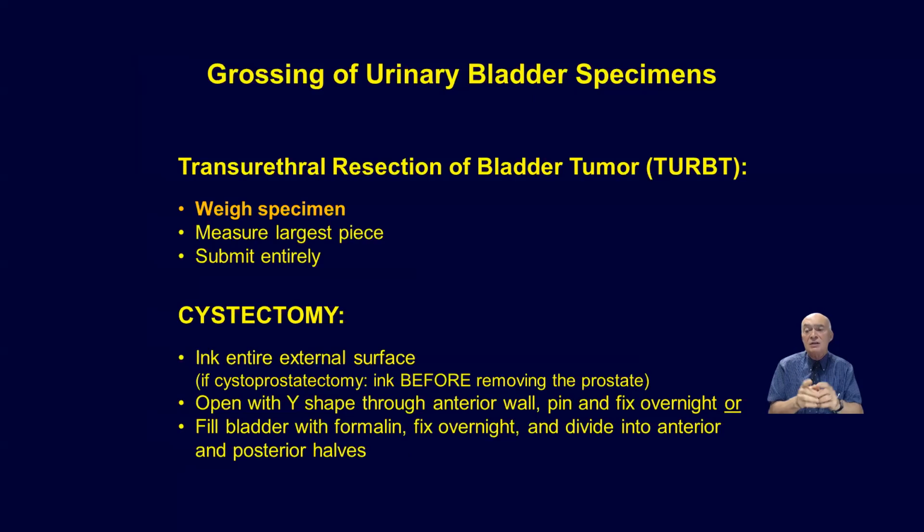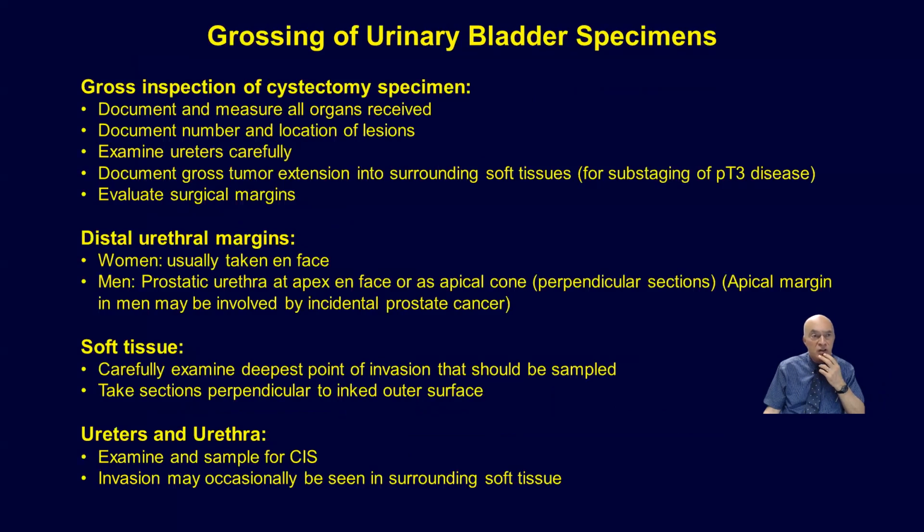But it's extremely important that you open the specimen and put it into a cork base, or a kind of board with pins around, to be able to expose all the internal aspects of the specimen, because if you just put the urinary bladder without opening it, it's going to fix very nicely the external aspect of the bladder, but the internal aspect is going to be rotten, and you are not going to be able to have a very good histological evaluation. Now, again, all these are part of the protocol of the CAP.